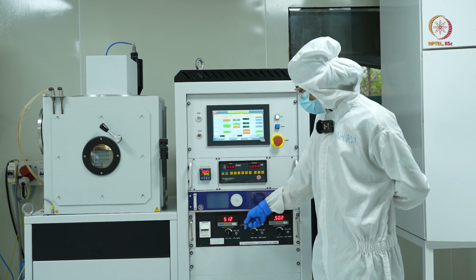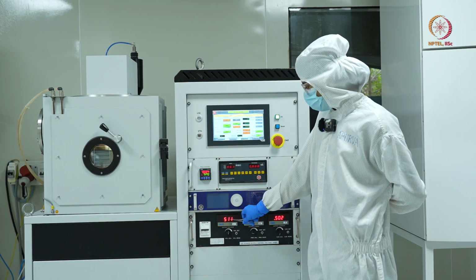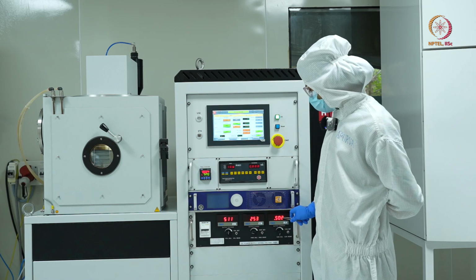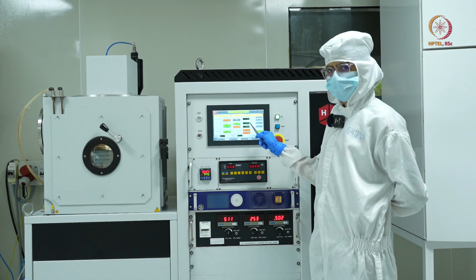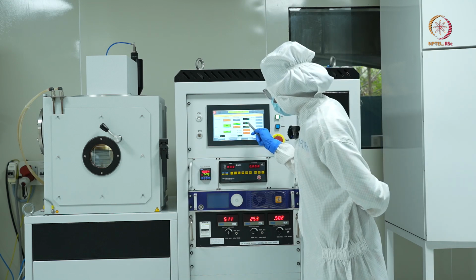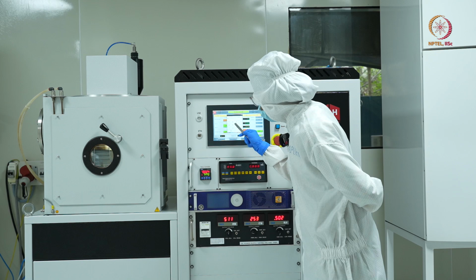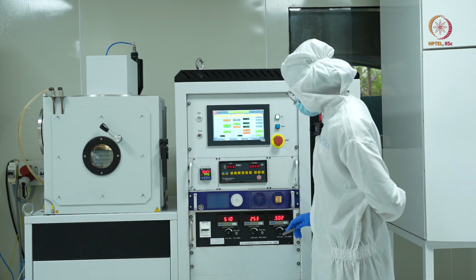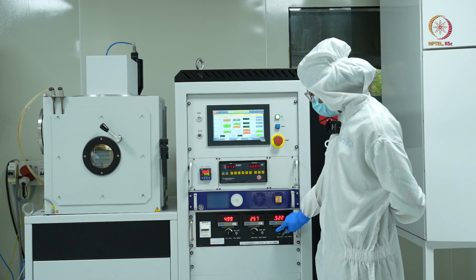Okay, now as you can see, my read voltage has decreased to 500. That means my current is not sufficient as well as my argon flow is also not sufficient. So what I'll do, I'll increase my argon flow to 15 and I'll increase my current to 0.55 amperes.